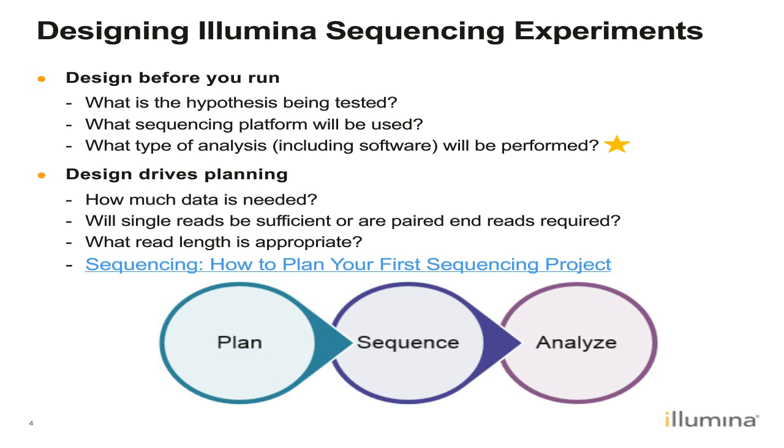Another important question is, will single reads be sufficient or do you need paired end reads? This again becomes important because if you're using particular software or if you're looking at a particular algorithm that you want to use, some may not do well with, say, paired end reads and may require single, while others look for paired end reads to complete a particular analysis. And then, what read length is appropriate for your experiment? This also becomes very important depending on what you're trying to do or accomplish.